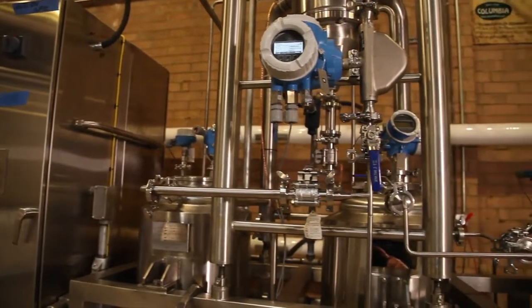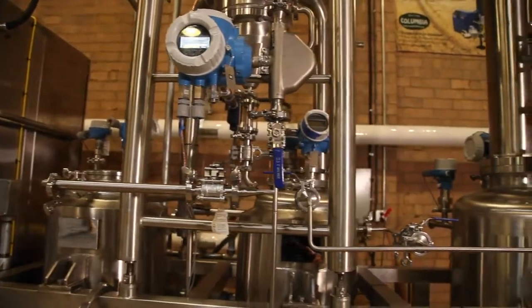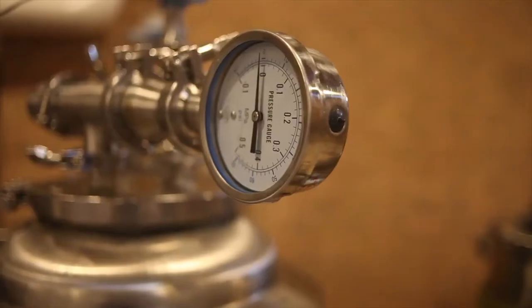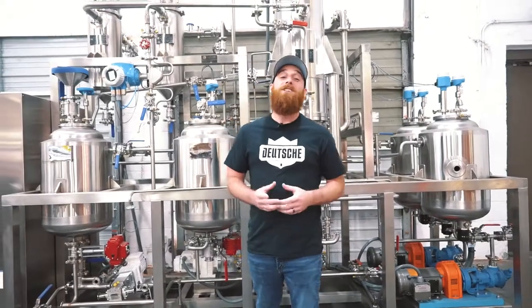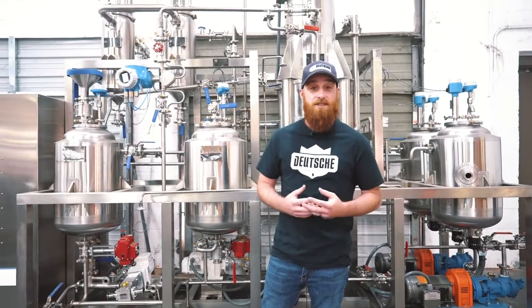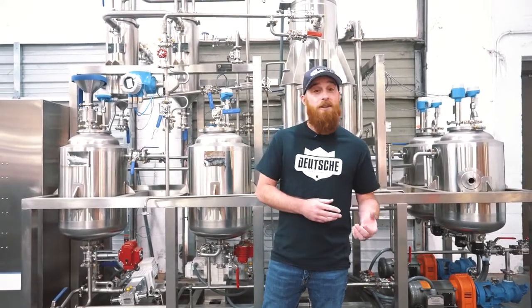The agitated short path distillation unit or SPDU is a molecular distillation system for separating high molecular weight mixtures based on different boiling points. Distillate is one of the most commonly made types of cannabis oil, mainly because of its high concentration and potency. Because it's virtually stripped of everything but the cannabinoids, it has a lot of versatile uses.